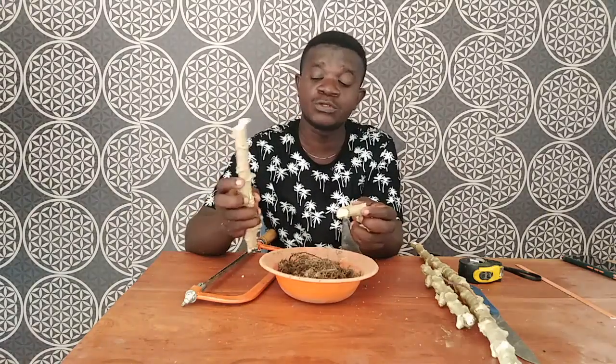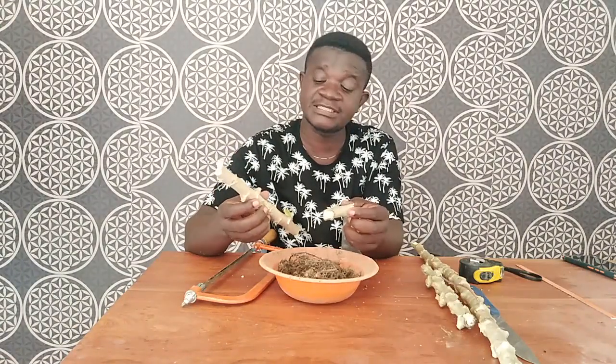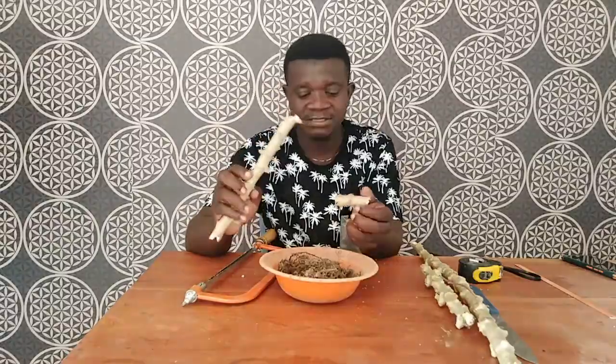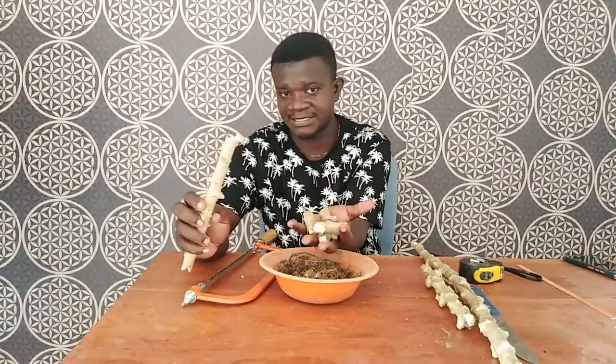Because look at this small piece — it's easy to root and germination is easy to explain. It grows faster than planting with a long stick. The most important thing in cassava is to get the roots. You can see how the root is — this is the most important part of the cassava. So instead of planting this whole big thing, we have done some groundwork over there. We want you to go and see how we have done our nursery. It is very simple — let us go and watch.